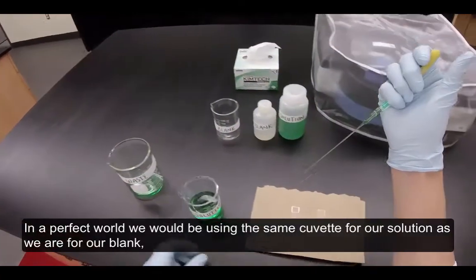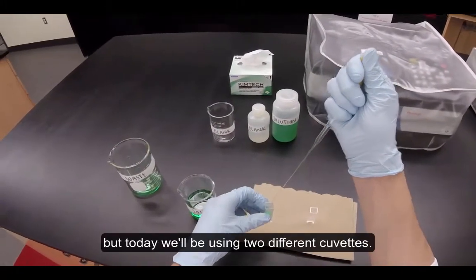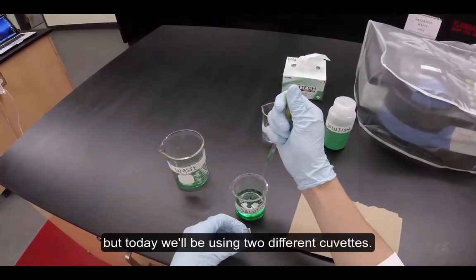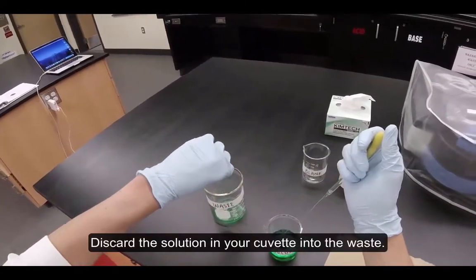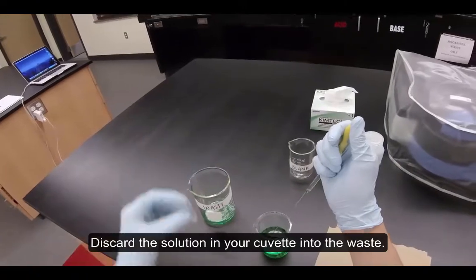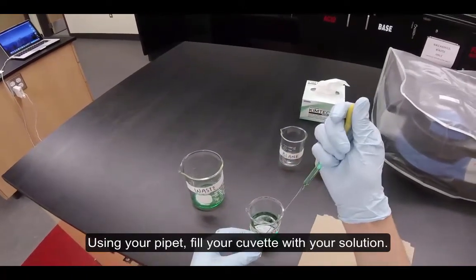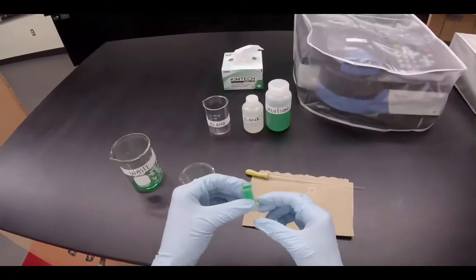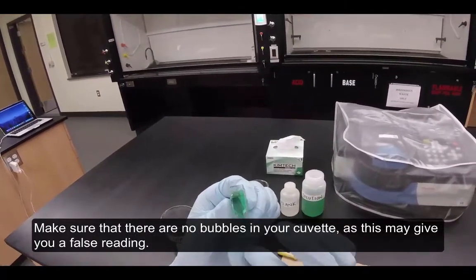In a perfect world, we would be using the same cuvette for our solution as for our blank, but today we'll be using two different cuvettes. Discard the solution in your cuvette into the waste. Using your pipette, fill your cuvette with your solution. Make sure that there are no bubbles in your cuvette, as this may give you a false reading.